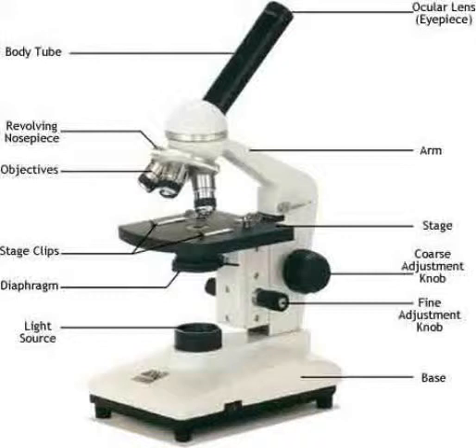Number 3, place a drop of this fluid onto a clean slide and spread the drop to make a circle about the size of a dime, and add 1 drop of iodine and place a cover slip on top of the iodine. Examine your slide under low power. You will see numerous black circles and ovals. These are starch grains from the potato. Move the slide around to find a field that has about 100 starch grains.